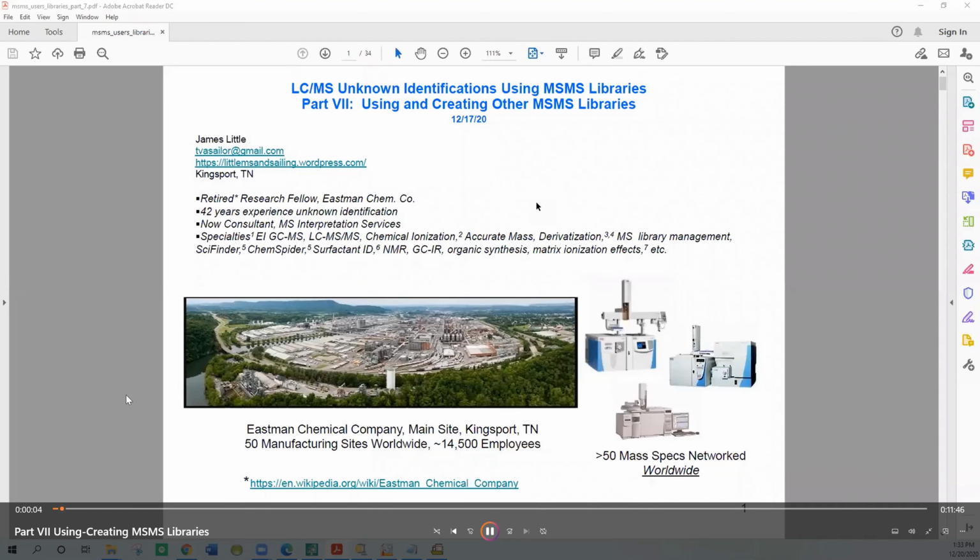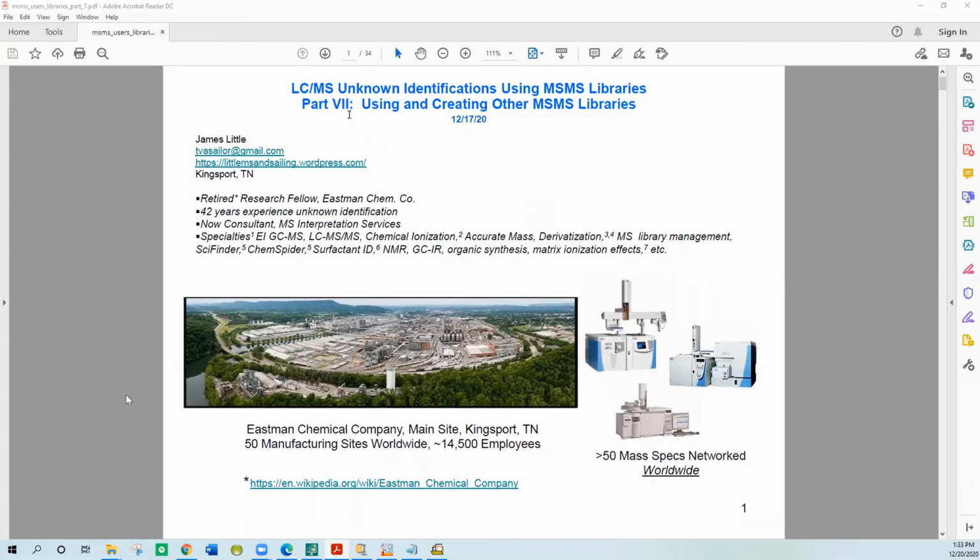Good afternoon. This is part 7 of a multi-section webinar series on LC mass spec unknown identifications using MSMS libraries. This part covers using and creating other MSMS libraries. NIST search considers anything that's not a NIST commercial library as a user type library, so you have to convert it in some way to get it in the hybrid format in particular that will be searched within the NIST search.